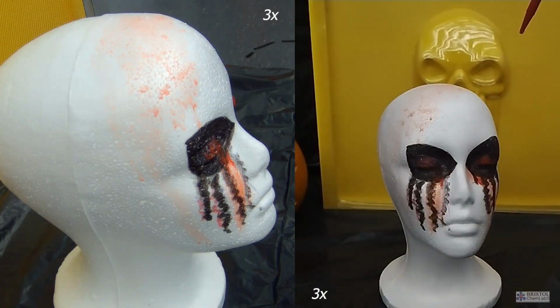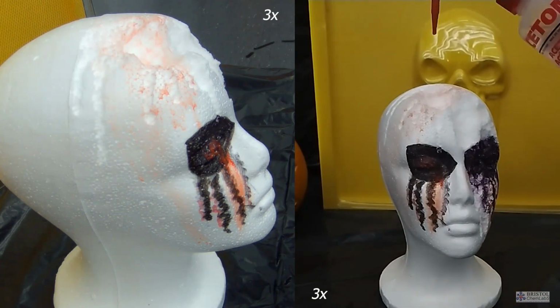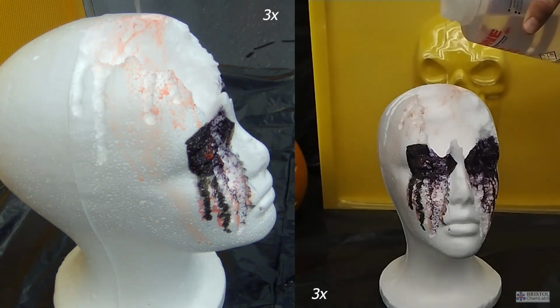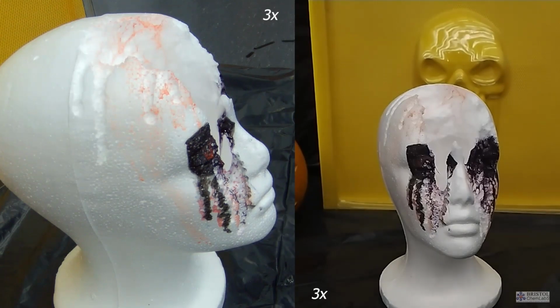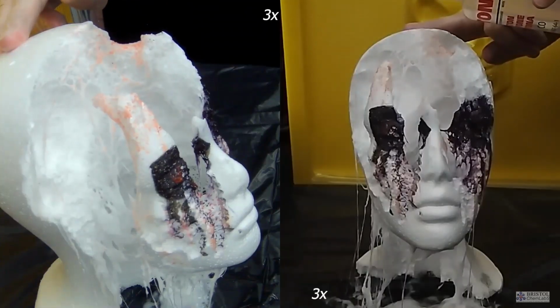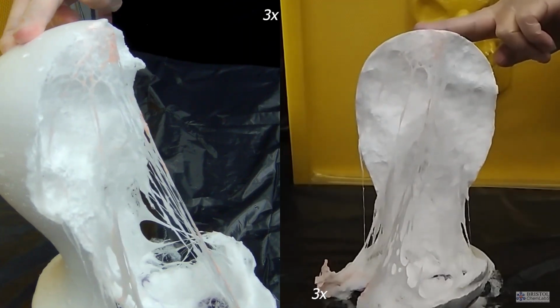You might also have come across expanded polystyrene. In this case, the gas pentane is blown through the polystyrene during manufacture, and it ends up, after gas exchange, being about 98% air and 2% polymer. It's a really handy packaging material because of its low density, but it can also be used to decorate your Halloween party. In this case, we're using a solvent, acetone, to partially dissolve the polystyrene chains and release that air. It gives a rather pleasing and gruesome effect.